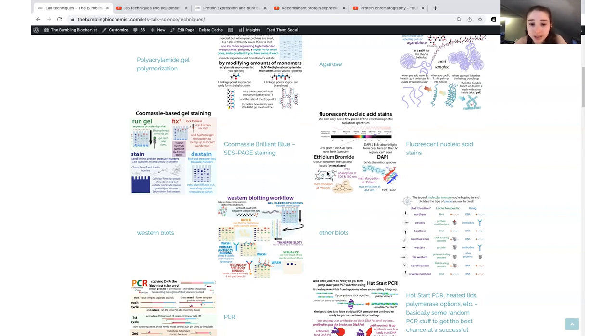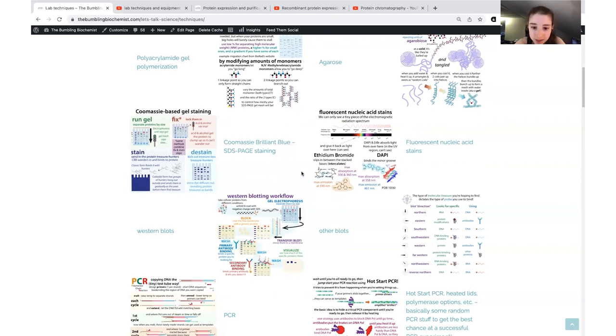And because it intercalates like this, it's been thought to be potentially carcinogenic, so cancer causing. But the truth is you'd have to be exposed to a lot of it without safety precautions. So it's not as dangerous as you might think to work with.